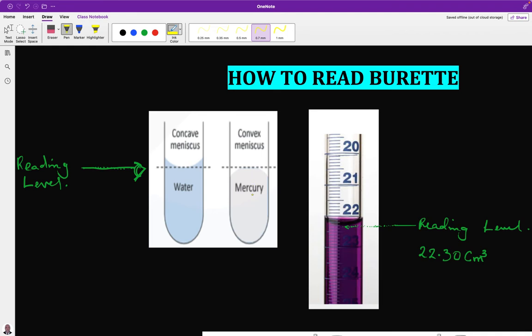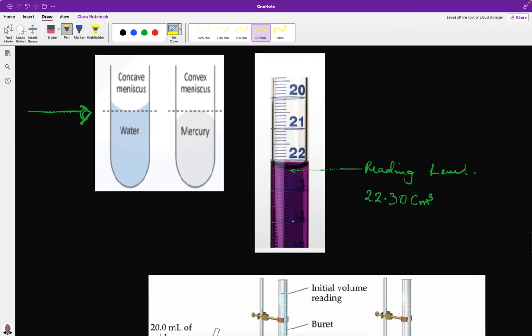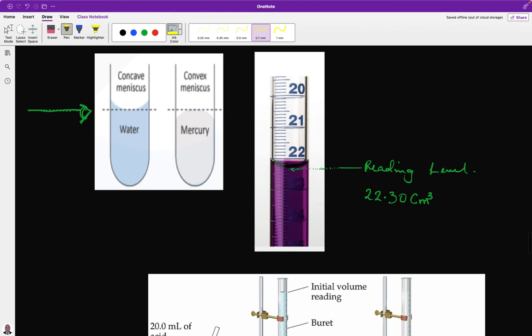When reading a burette with a solution, we have what we call a concave meniscus. The meniscus must sit on the line you read — where the meniscus sits, that is where you take your reading. For example, in this burette shown here, the reading is 22.30 cm³.